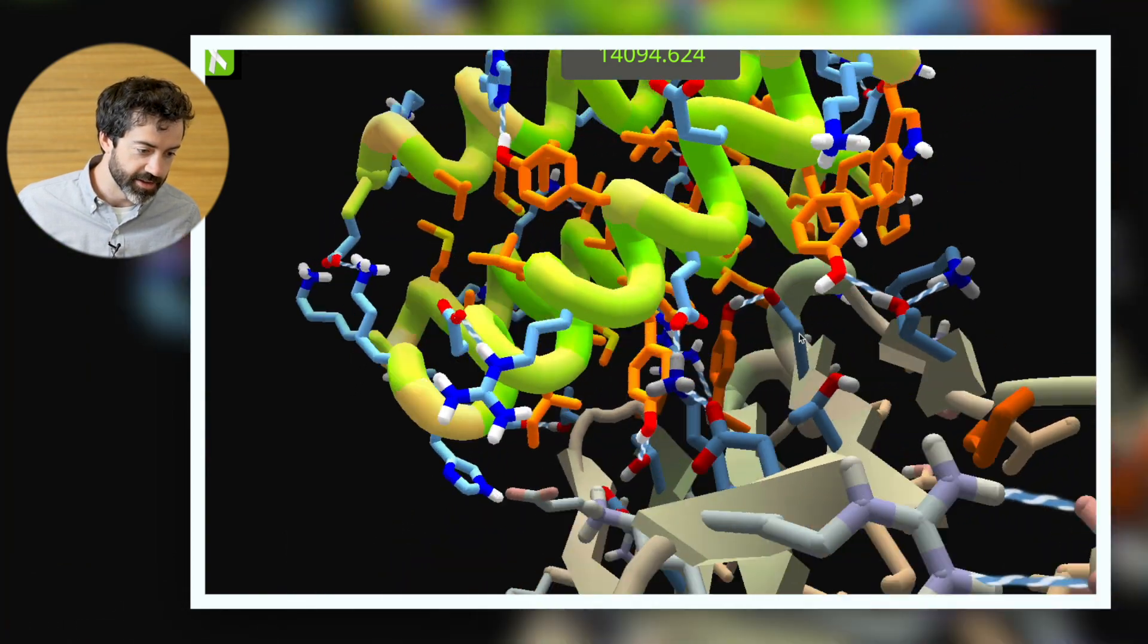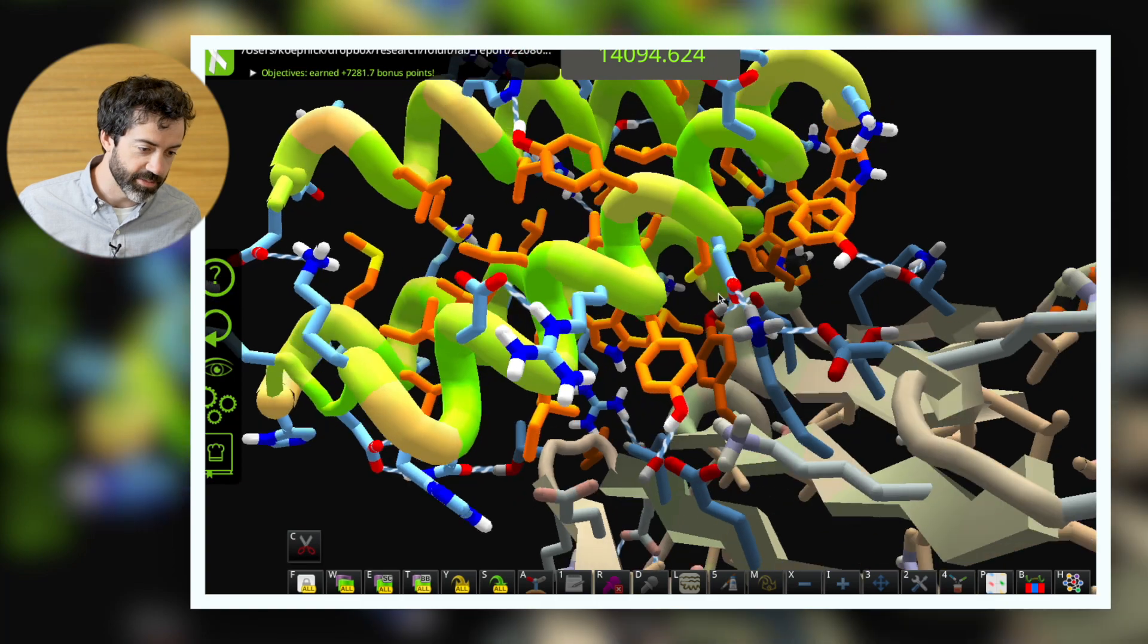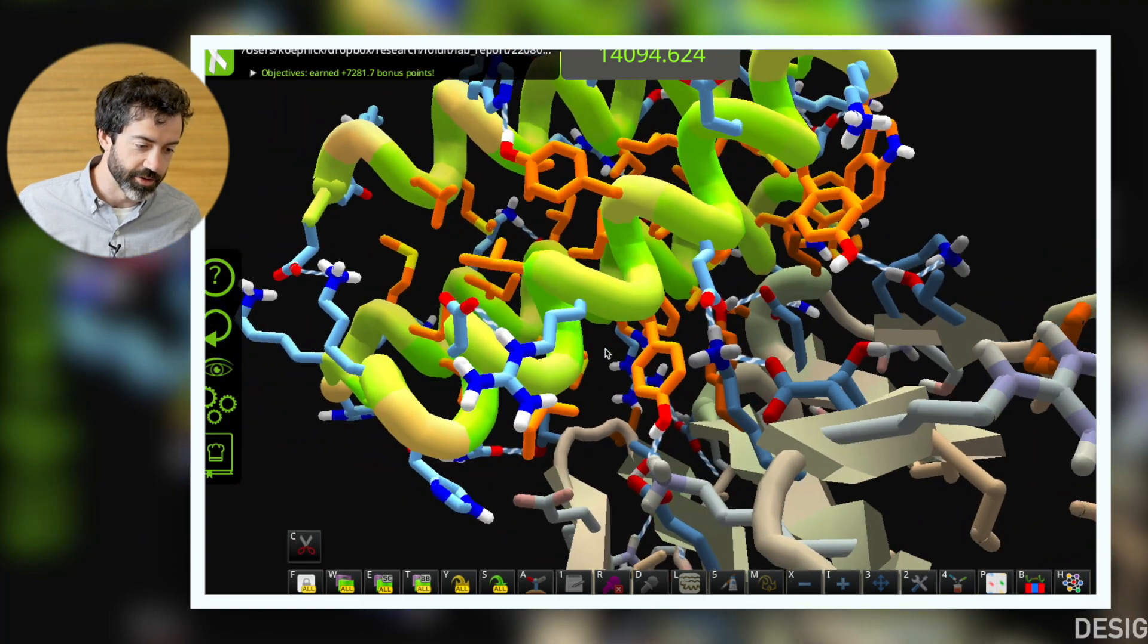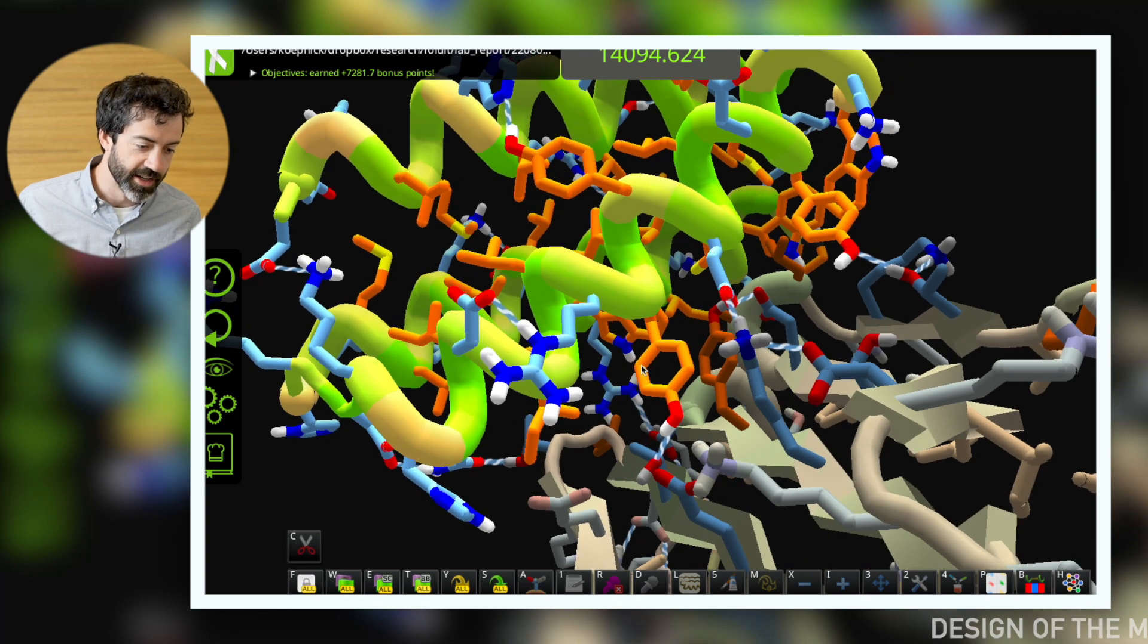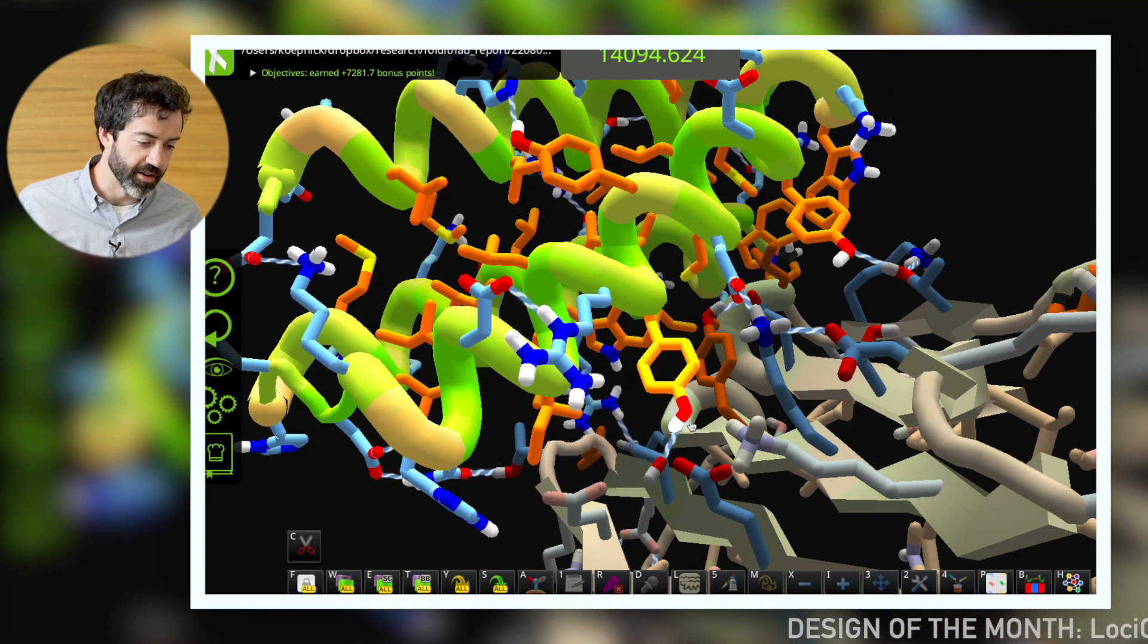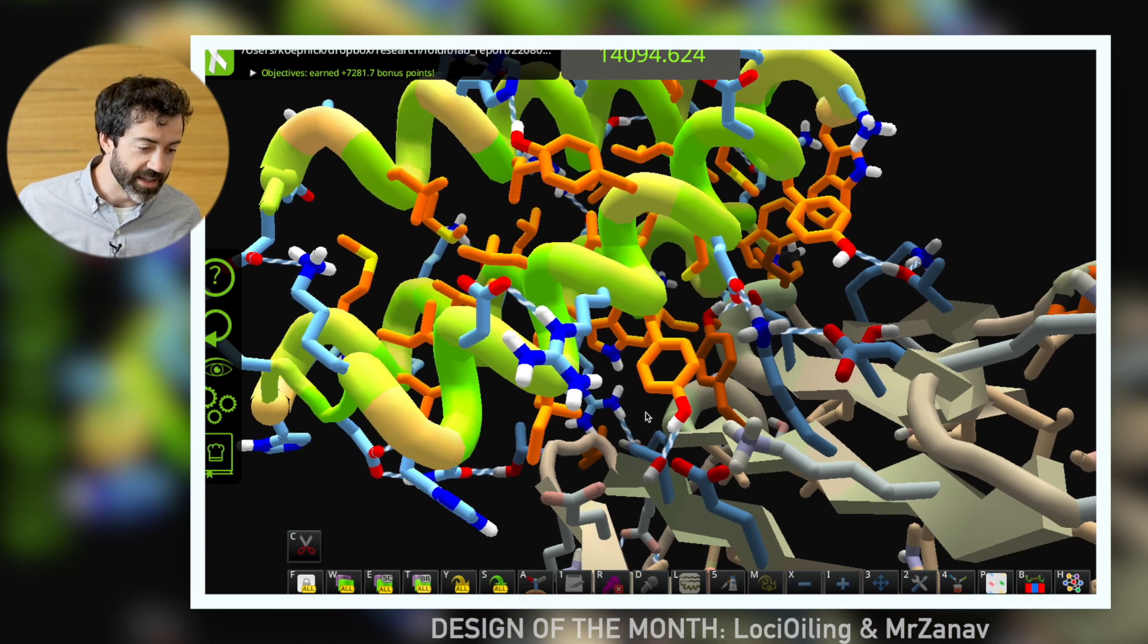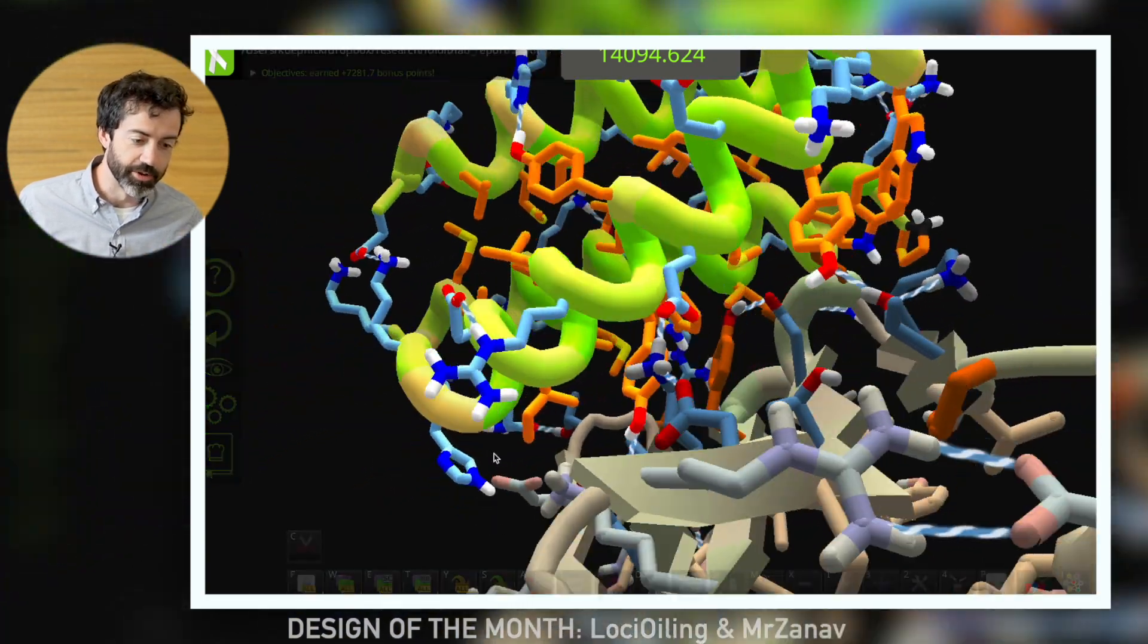I also like this tyrosine here, which packs pretty nicely against another tyrosine in the target. So this looks like a good packing interaction. And furthermore, this hydrogen bond on the binder side making a contact with the target may give us some specificity bonuses here.